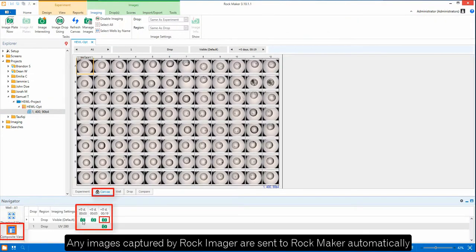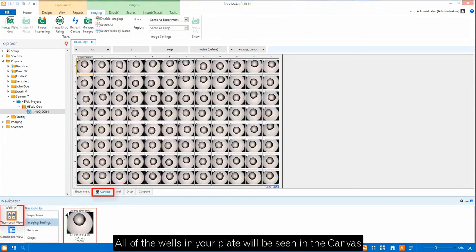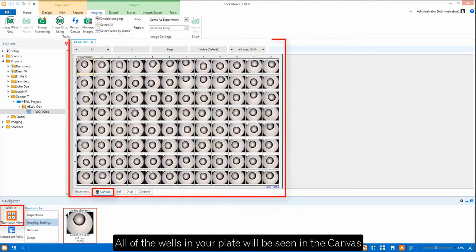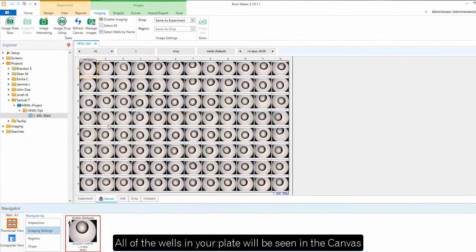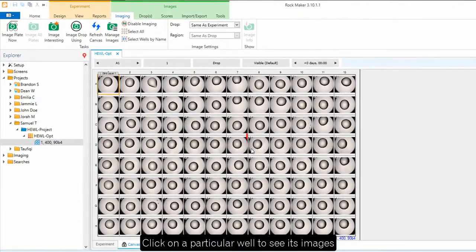When you open an experiment, you can see the canvas which shows you all of the wells in your plate. From here you can click on a particular well to see its images.